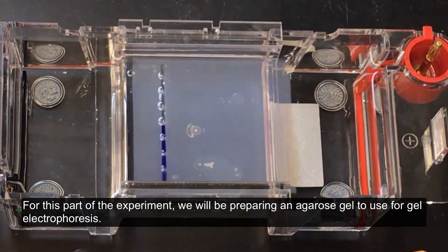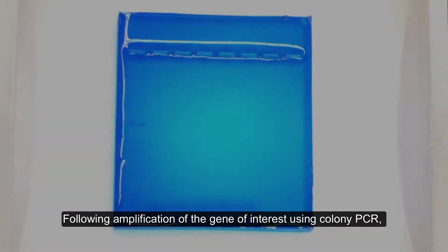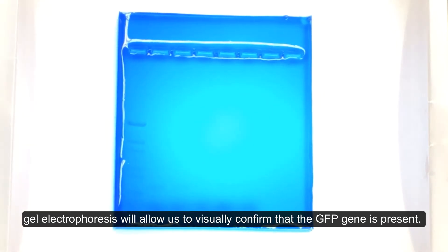For this part of the experiment, we will be preparing an agarose gel to use for gel electrophoresis. Following amplification of the gene of interest using Colony PCR, gel electrophoresis will allow us to visually confirm that the GFP is present.